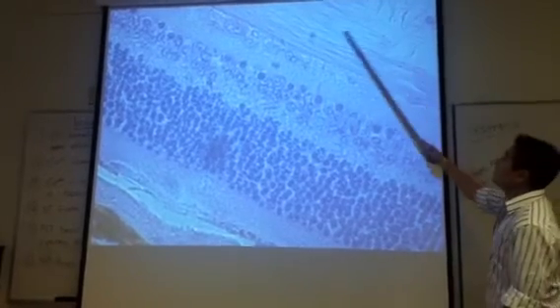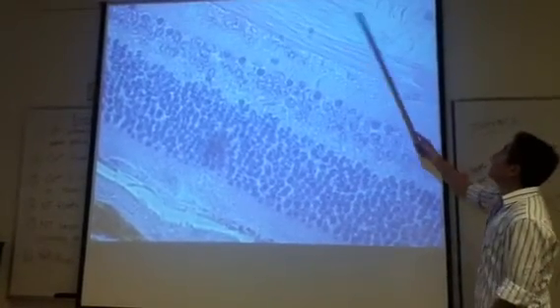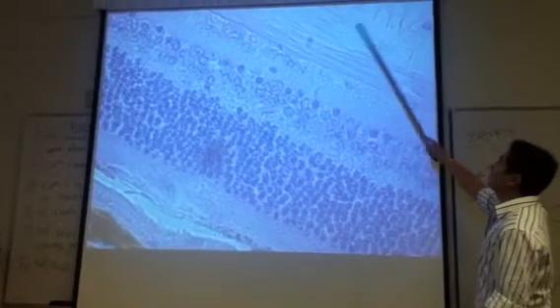And then what is this layer right here? Part of the ganglion cells. Part of the ganglion cells. The nuclei are the sum of the ganglion cells. You guys all see those differences? So then what's above this then? What's all this right here? And actually, this is still part. Some of the somas in here. What is all this made of?